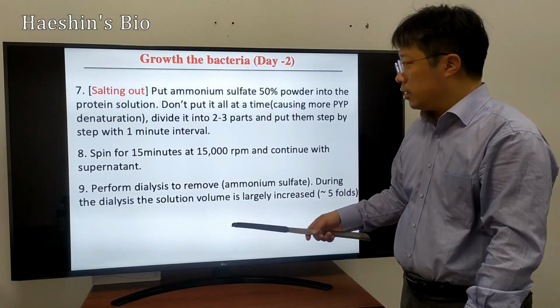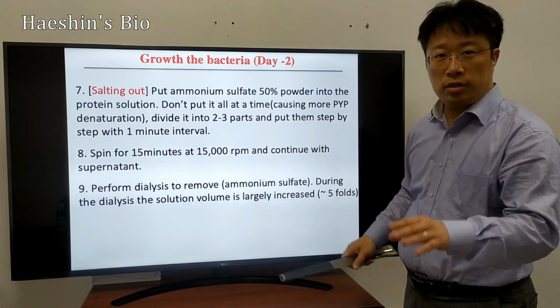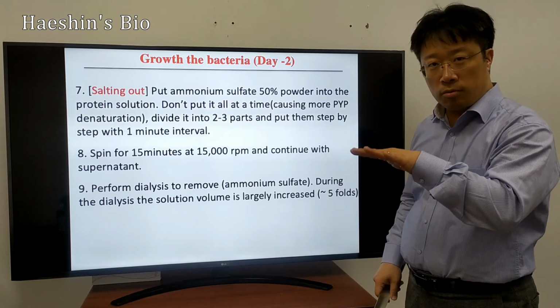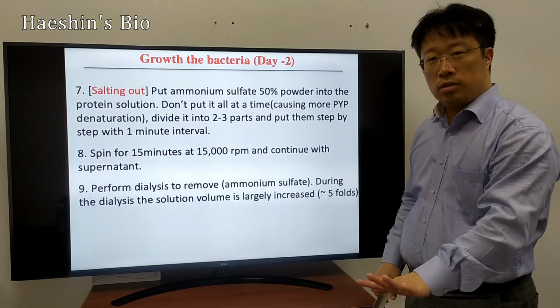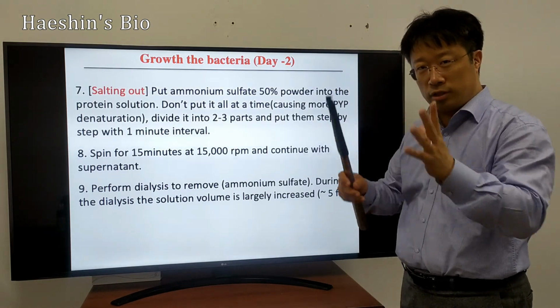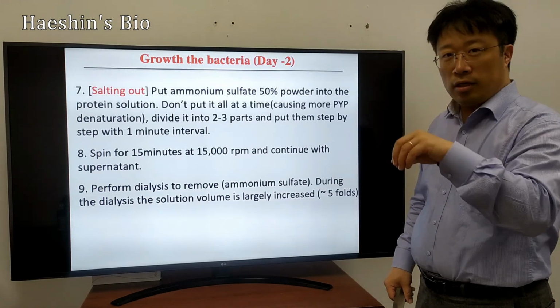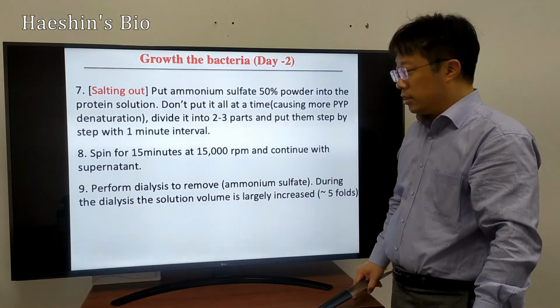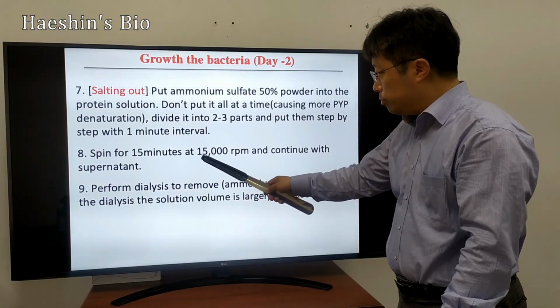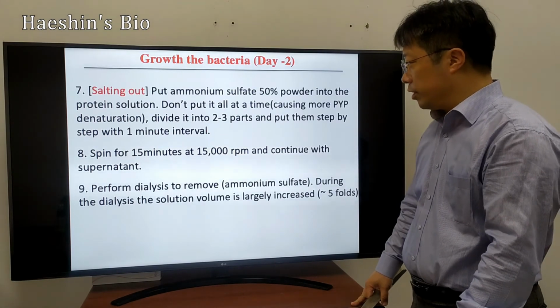So now after the ammonium sulfate addition, proteins with a low solubility will precipitate out. You will see basically not a precipitation, but actually this overall solution is clouded. So that clouded precipitated complex will be separated by centrifugation at 15,000 RPM for 15 minutes.